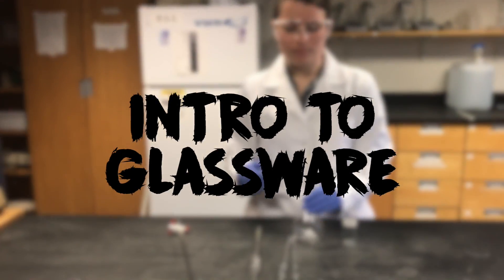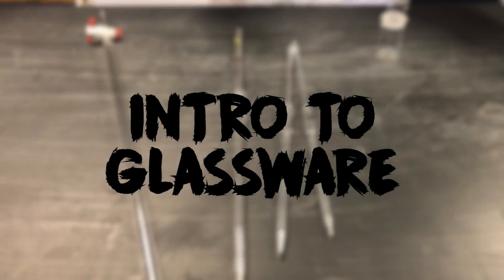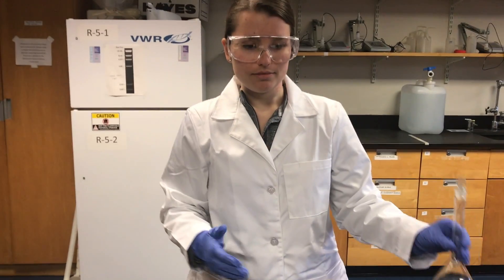Welcome to CHEM 216 quantitative analysis. First we would be talking about common glassware you will use in this lab.